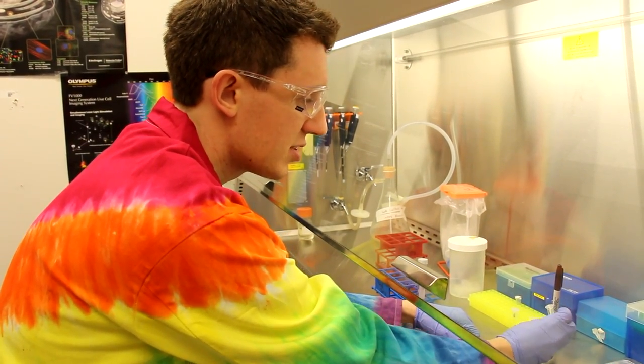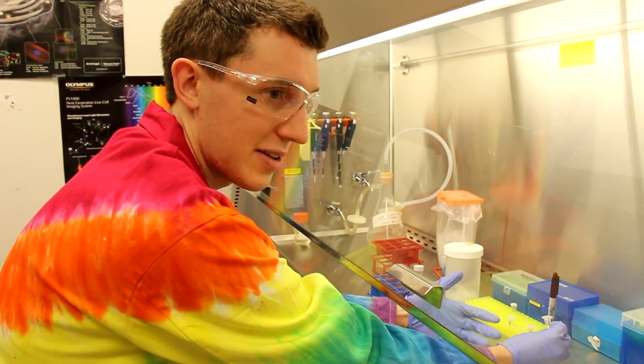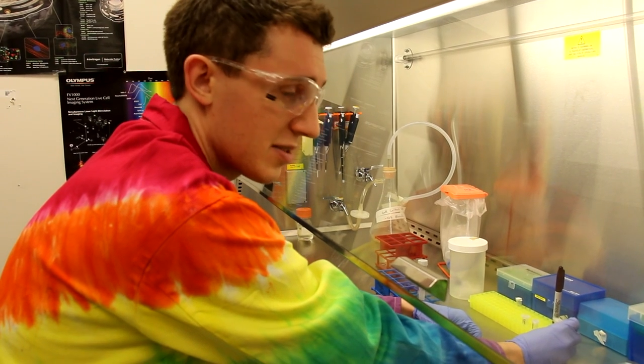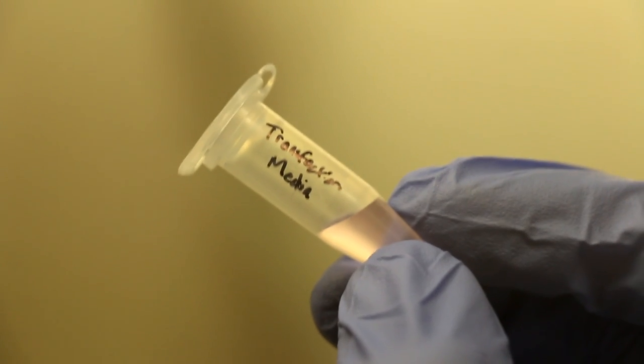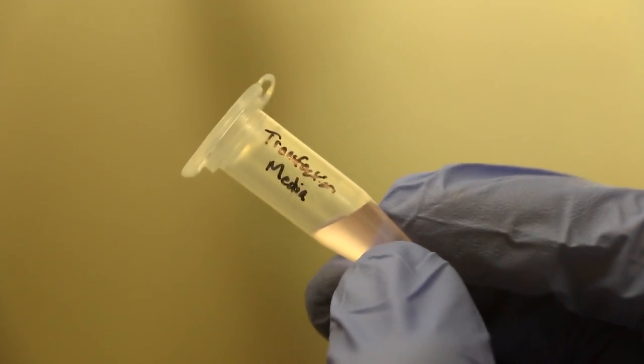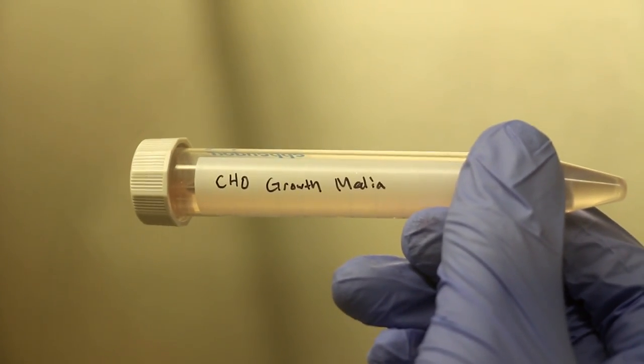Next you'll need a tube of Fujin reagent. We take aliquots as it's a sensitive reagent. Then you'll need a tube of transfection media to perform the transfection reaction, and finally a tube of growth media to mix the transfection reaction in before applying it to the cells.